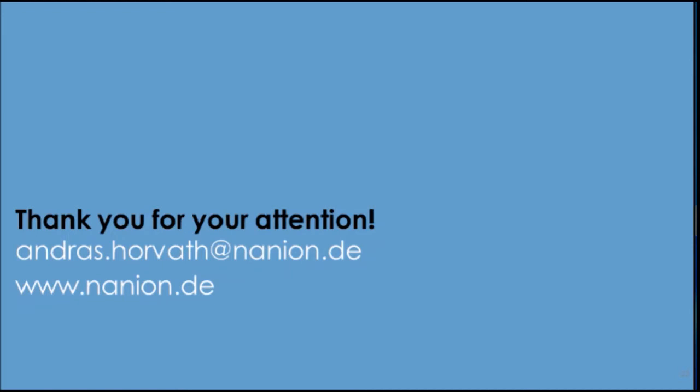Right, thank you, Andras, for an introduction to the technical aspects of the Patchliner. I'm now going to spend the next 25 to 30 minutes talking about how we use this platform in a real-world ion channel drug discovery project.